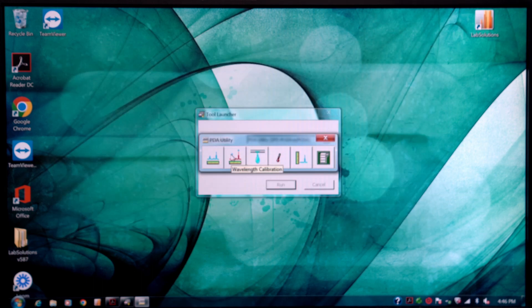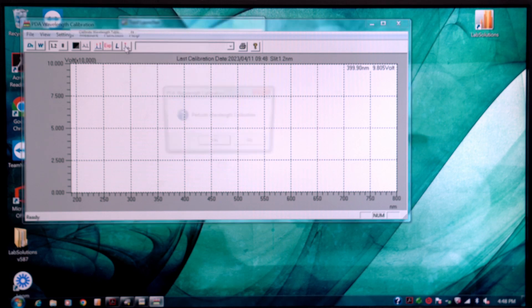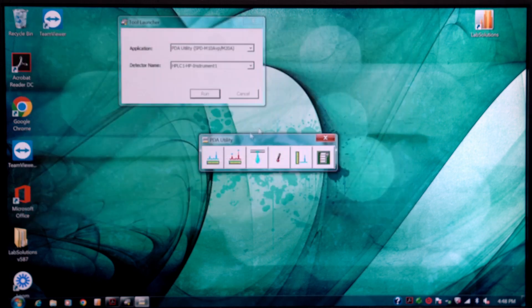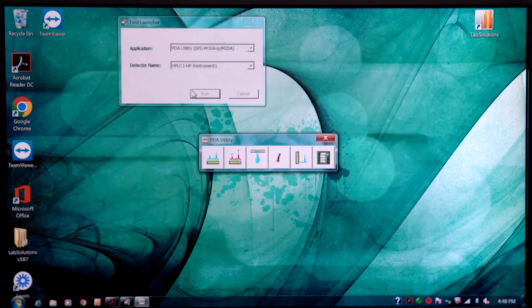You go Function and you calibrate the wavelength table, and you click Yes. After this, you go back here and you do another wavelength check like so. Now if that doesn't work, you go Function here, you set the exposure time, and then you click Yes over here.